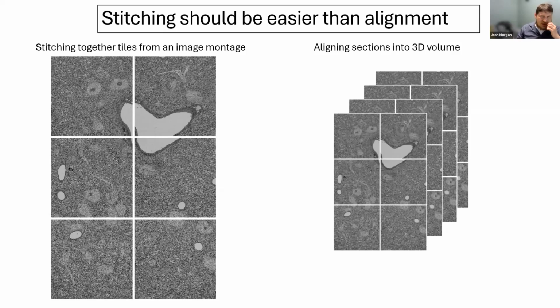All of those things make this potentially more difficult, and all of those problems get more challenging the larger the data sets get. So I'm going to spend a little bit of time walking through some of the terminology for image alignment so we can talk about the best strategy for different kinds of data sets. We're going to start by going over what a linear transformation is.